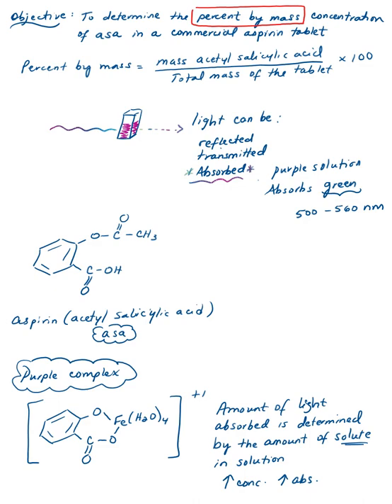Those solutions are known as standard solutions because we know the concentration. We prepare the standard solutions from a stock solution. They are dilutions of the stock solution. So if you know the concentration of the stock solution, you can calculate the concentration of the standard solutions. With the standard solutions, we're going to prepare the samples that we're going to use to measure the absorbance.